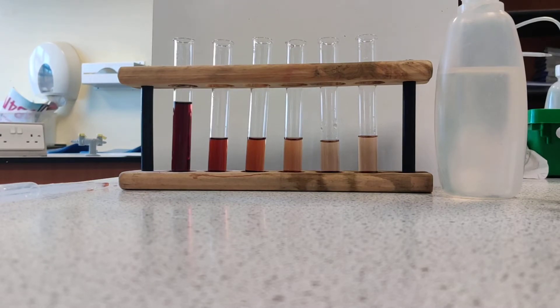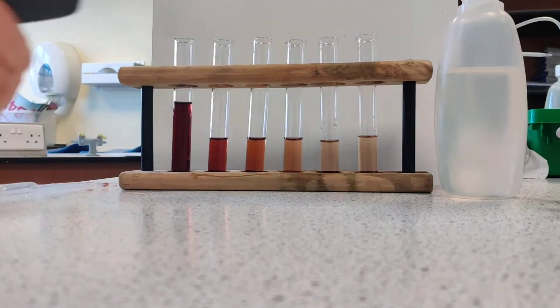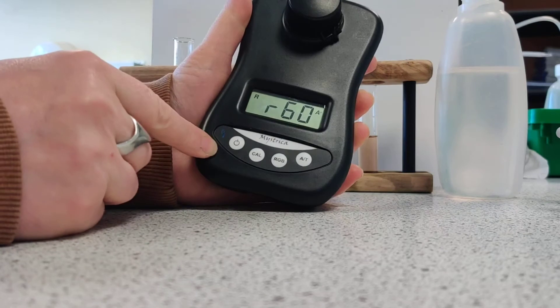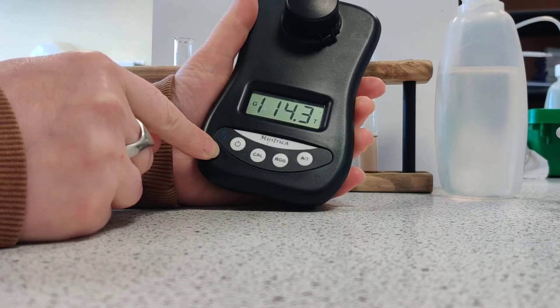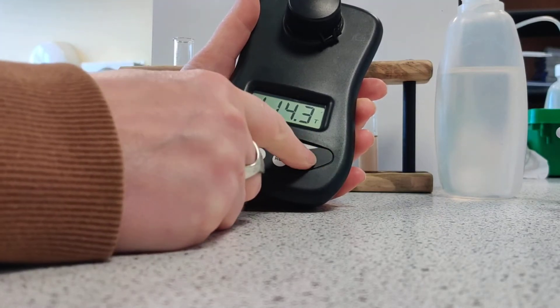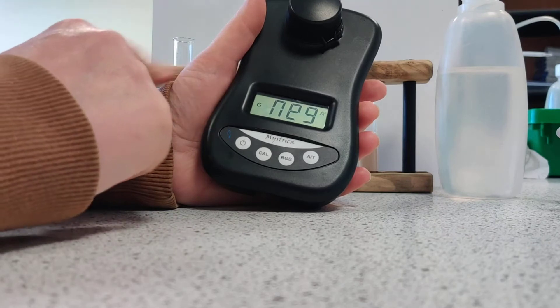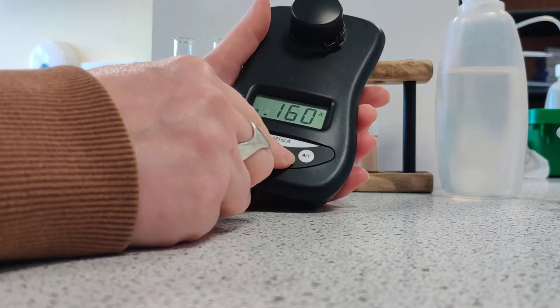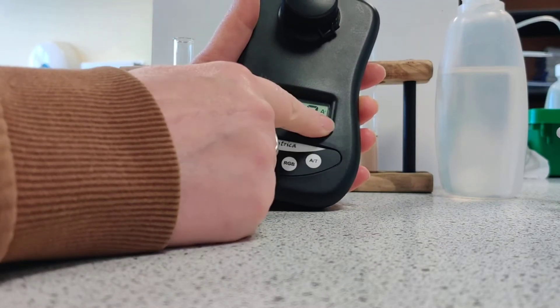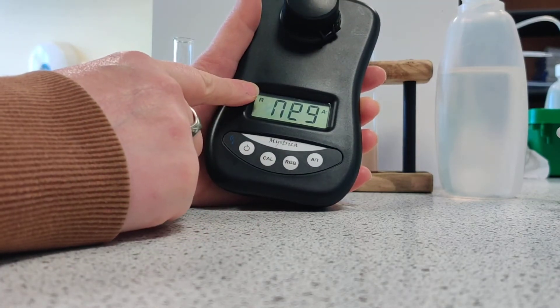Colourimetry at BTEC is done in one of the coursework assignments in Year 12 for chemistry, and it's really simple. We just use these little gadgets called a colourimeter. Switch it on, and we can measure red, green, or blue absorbance or transmission. I'm going to set it to absorbance today, and I'm going to see how much red light is absorbed by these reddish solutions — so R for red and A for absorbance.